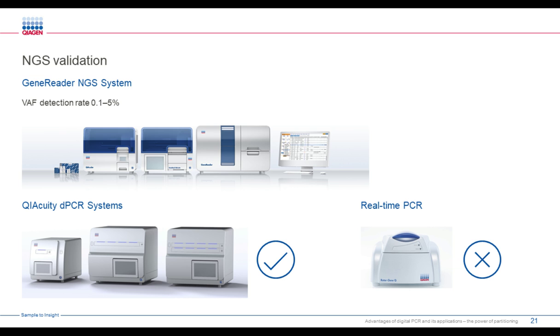If we talk about next generation sequencing and digital PCR, this is a very good match, a good marriage, if you will. Because normally, next generation sequencing, if you use MiSeq, HiSeq, Ion Torrent, or NovaSeq, you can go down to, let's say, 1% or 0.1% at best.